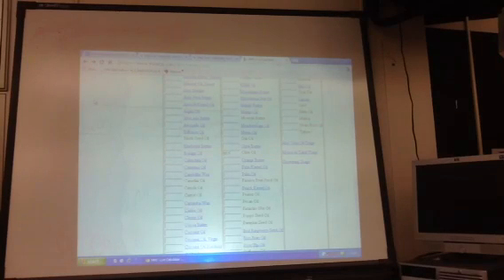Okay, so here's what I want you to do. I want you to look at your pre-calculations. What is your total amount of fat that you said we need to use to make our soap and have 10% excess fat? 95 point something. Because it was 86 plus our 9.5% extra fat, right? Yeah. Okay. So this calculator takes into account all those different fatty acids in the soap.